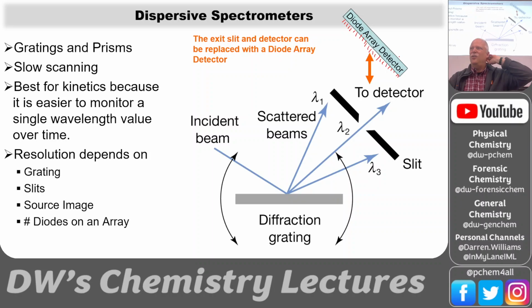Now those are very noisy detectors, because they crank up the sensitivity, so they basically give a lot of false signals because they're at room temperature, and so they say they're measuring light. You can put it in a completely dark room and it would still give you a signal. So it's just false photons. So what you do is you want to count a background. You shut everything off, don't let any light in, and say count for 3 seconds. And so it counts for 3 seconds and gives you that signal. And then you open the shutter, take a spectrum for 3 seconds, and you get all your peaks, but it's very noisy. And so you just subtract that noise, because those false signals are repeatable. So the same amount of false signal you get every 3 seconds, you could subtract from your regular spectrum.